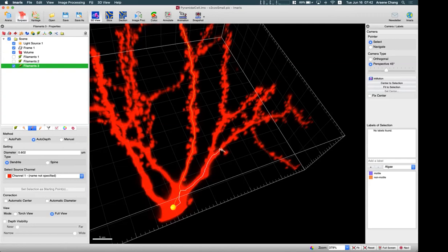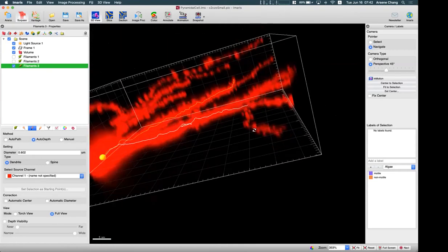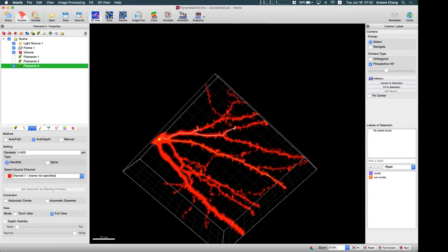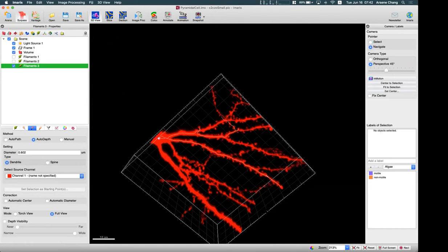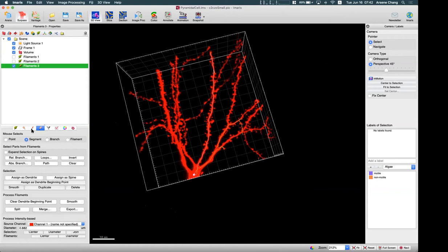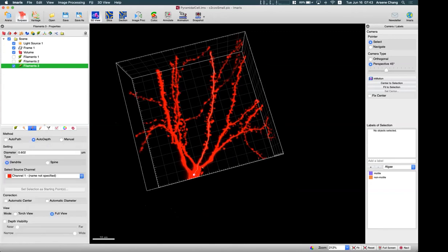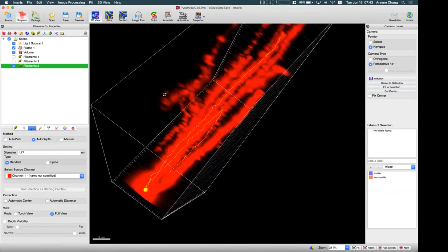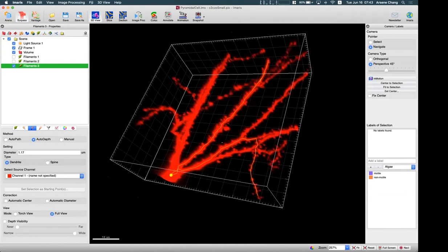For this part, select the point and hold Shift and left-click to draw again, moving along the structure. It's not as easy as auto path, but for some samples it may be useful. Hold Shift and left-click and keep moving along the structure — now it works. Release the left click to finish. You can see it correctly traces the branches according to your pointer movement.